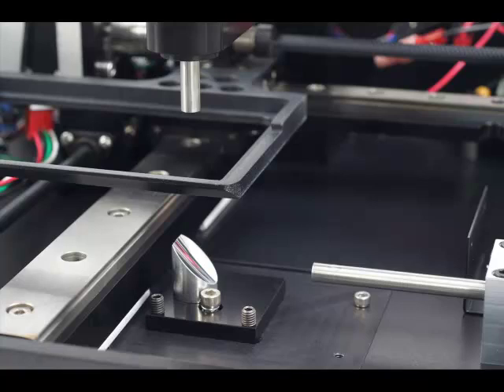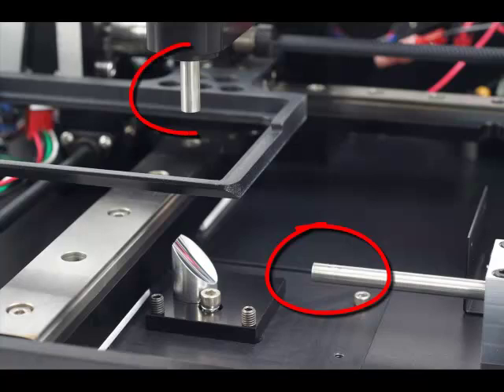For instruments that do not support an external detector, the optical configuration features a transfer optics module mounted in the sample compartment and light out and light in optical fiber cables that mount to the reader's frame.